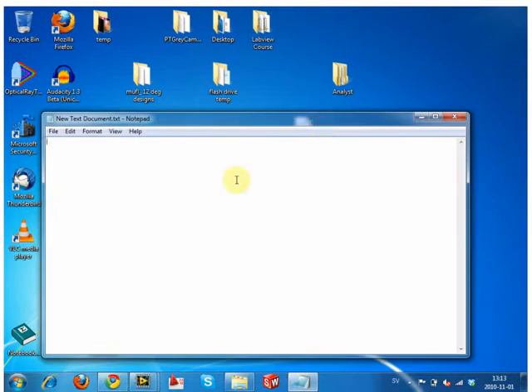In most operating systems, the numbering schemes go from left to right. So if we write 100, and then 101, and then 102, and tell it to order this list, it would order it this way. If we put 104 and then 103, and we said reorder this, it would switch these two positions round on the bottom. If we try a different set of numbers and we do 1, 2, 3, 5, 7, 10, 12, 23, 50, and said order this, it always starts with the first digit.